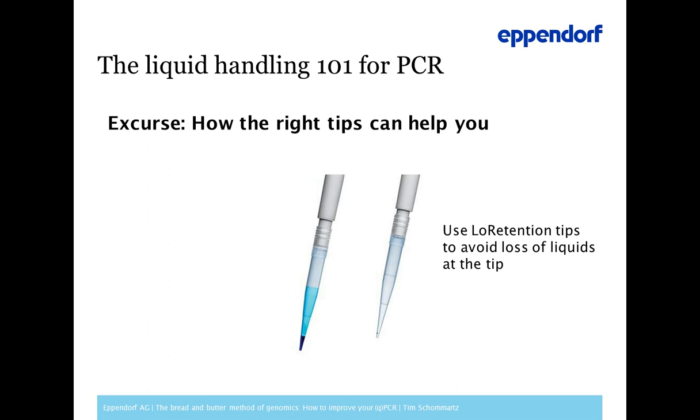So this is what was happening to me when I was working in the lab. I was preparing my master mix, and then I was putting my experiment together, and I accounted for some overage, and in the end I figured out, oh no, I'm missing like 3 samples. The reason is I was losing material to the tips. By using low retention tips, you can overcome that.